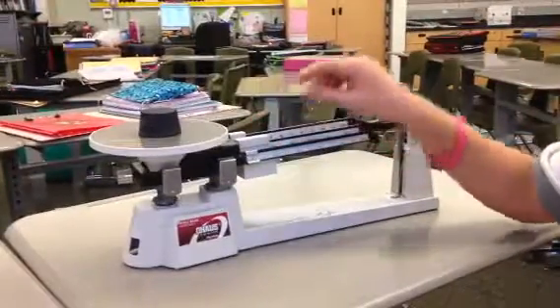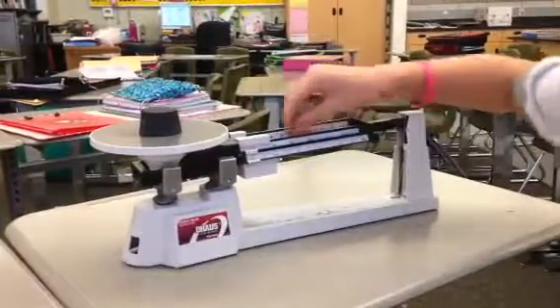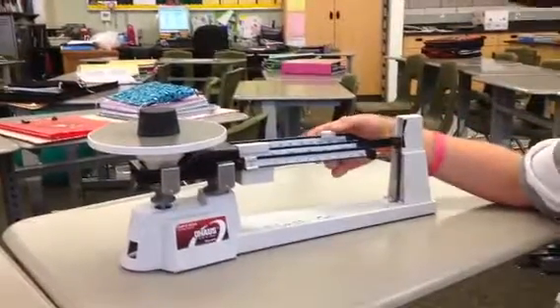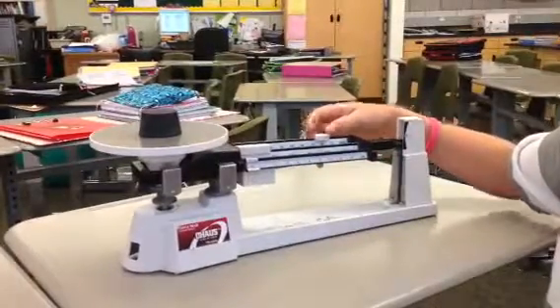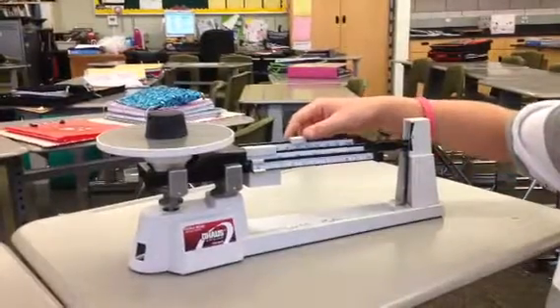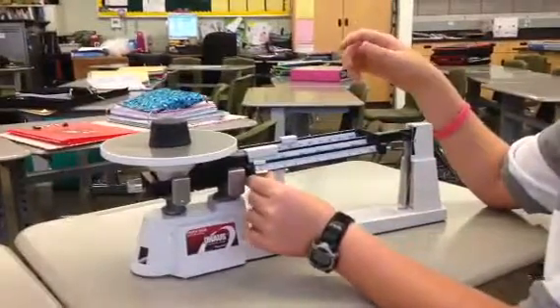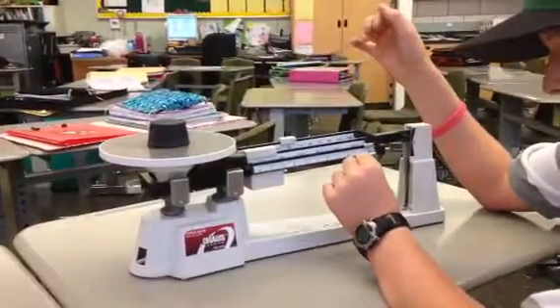So then you have to go back to 0. And because it's not any 100 grams, you just let that one go. Then you go on the 10 grams. Start at 100. That doesn't work, so then you go to 90. That doesn't work. So then you go to 80. If that doesn't work, then you go to 70, 60, 50, 40. Okay, so that's above. So that means that it's going to be somewhere in 40 to 50 grams.